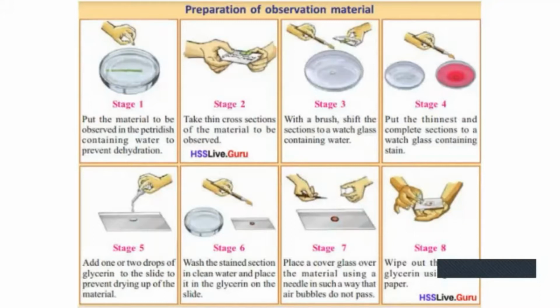Then stage 4, put the thinnest and complete sections into a watch glass containing stain.